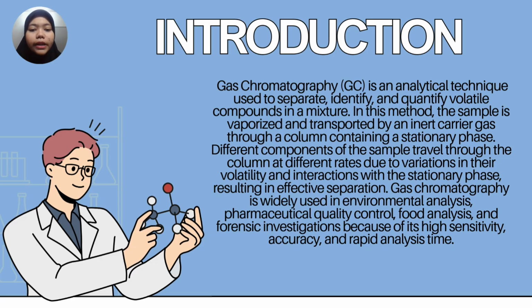Gas chromatography is widely used in environmental analysis, pharmaceutical quality control, food analysis, and forensic investigation because of its high sensitivity, accuracy, and rapid analysis time.